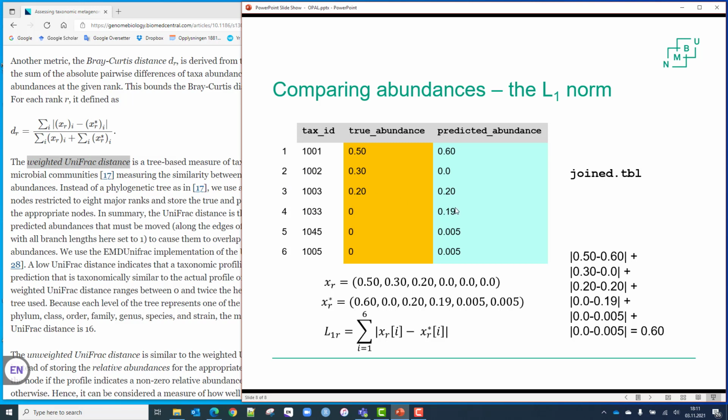So actually we claim that these reads are from this species, but we are now confusing it with this species here, and we should actually have assigned these up here. So if that is the case, then the picture is not as poor as it looks like now. Do you agree? You missed, but you missed only with the neighboring species, you could say.